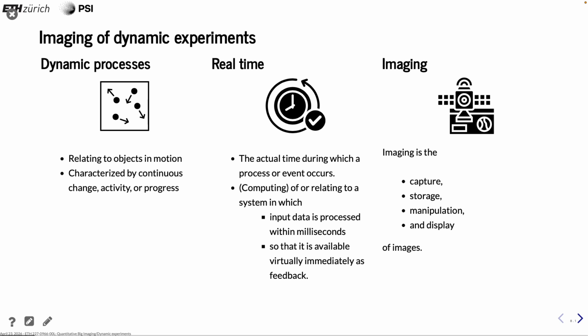And that means often when we're talking in computing that you should do the processing of data within milliseconds, and you should have a visual effect that it's happening immediately. So it's actually not always that real time means that you need to be really fast. It needs to be in the rate of the process that you observe. And usually, for the analysis, you're not so interested in having it instantaneously. It's more important that you have it exact.